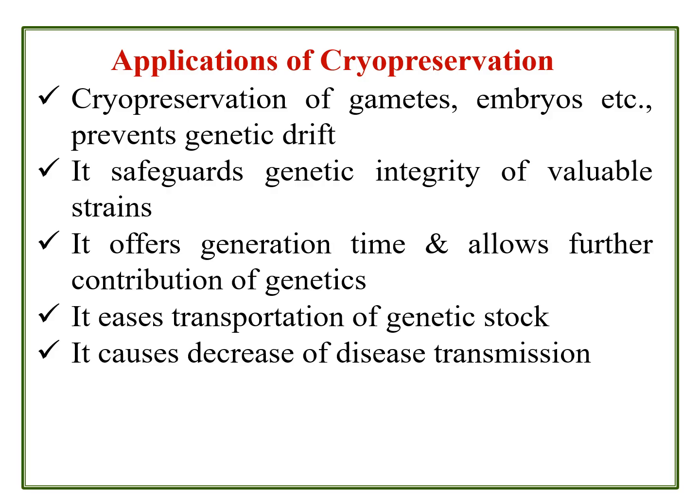More or less, after thawing or reculture, during the thawing culture, care must be taken, as any personal unhygienic practice may create problems for the ampoules.